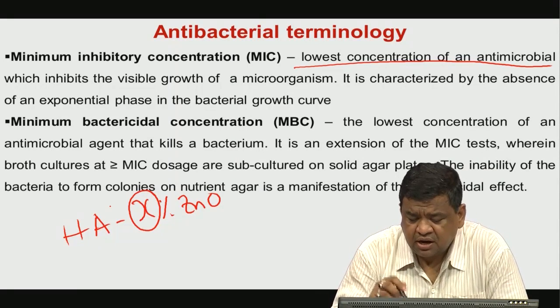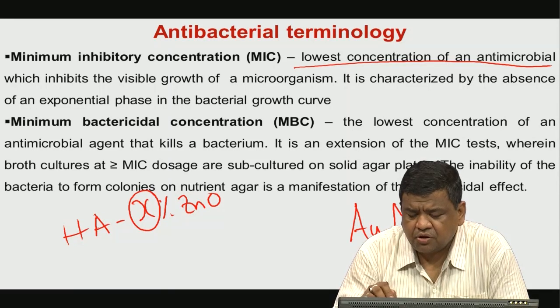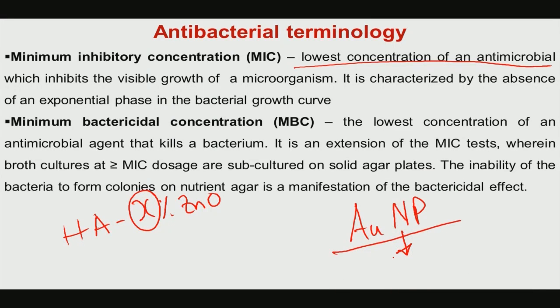Take the example of gold nanoparticles, AuNP: what is the dose of gold nanoparticles in solution which gives this MIC, which inhibits the visible growth of a microorganism.